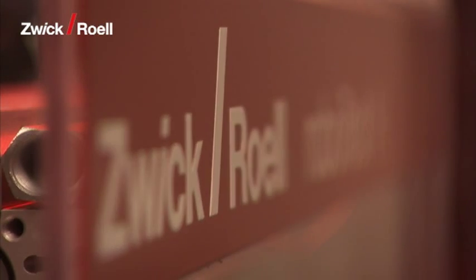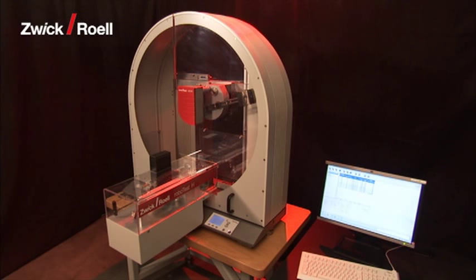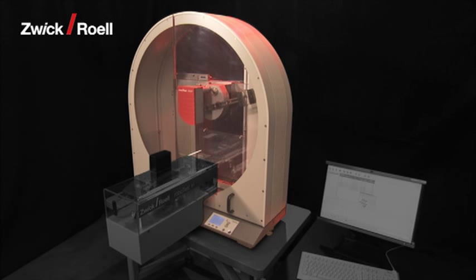The RoboTestH Robotic Testing System is designed for fully automatic Charpy or IZOD impact bending tests on plastic specimens. It consists of the following elements: the RoboTestH Robotic Testing System with specimen magazine, and the Zwick 25 Joule or 50 Joule Pendulum Impact Tester for Charpy or IZOD Pendulum Impact Tests to standards ISO 179, ISO 180, and ASTM D256.